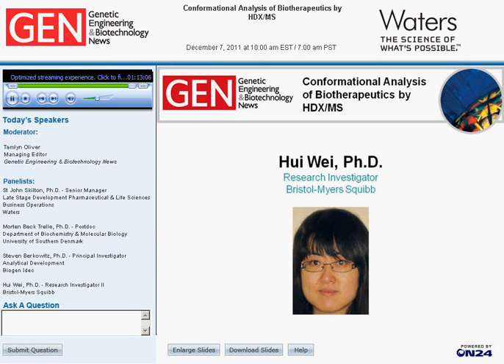And if you want to give a confidence band of, say, 98%, you multiply that number by 3, so you are giving 0.5 to 0.6 Dalton of confidence band. For the summed value of all the time course, I usually see about 0.5 Dalton, and so that gives us about 1.5 Dalton of the confidence band.